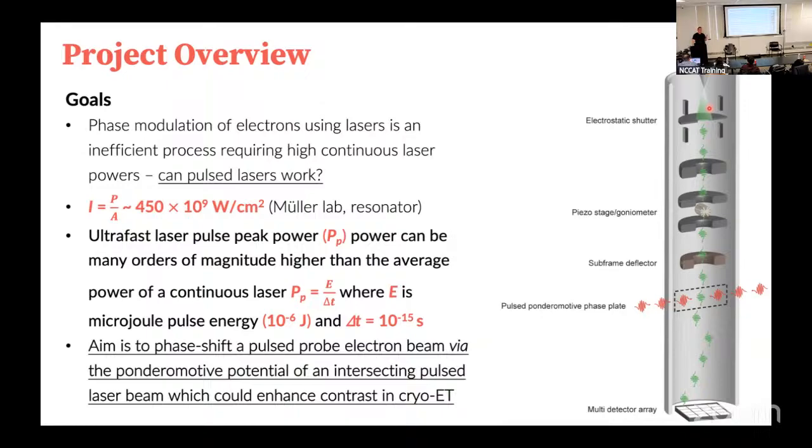A continuous beam means that you have a field emission gun at the top of the microscope. You have voltages applied that draw electrons off that FEG tip, and they get pulled down, pass through the lens, and you form images. The way that the electrons come off is effectively random, stochastic, so they're coming off all the time, but they're not periodic.